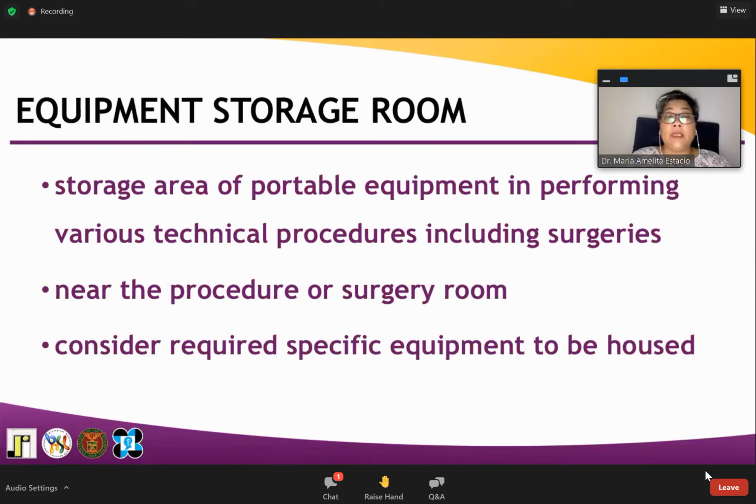Now, there is a separate equipment storage room. Usually this is where you place your portable equipment that would be needed for specific technical procedures, including surgeries. And usually this is located near the procedure or surgery room for ease in getting and, of course, storing back all this equipment. Again, the size would depend on the specific equipment that you would be housing in your equipment storage room.